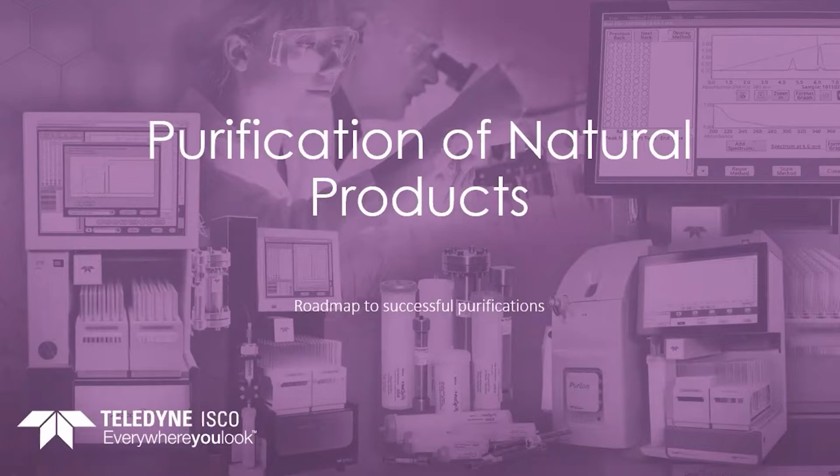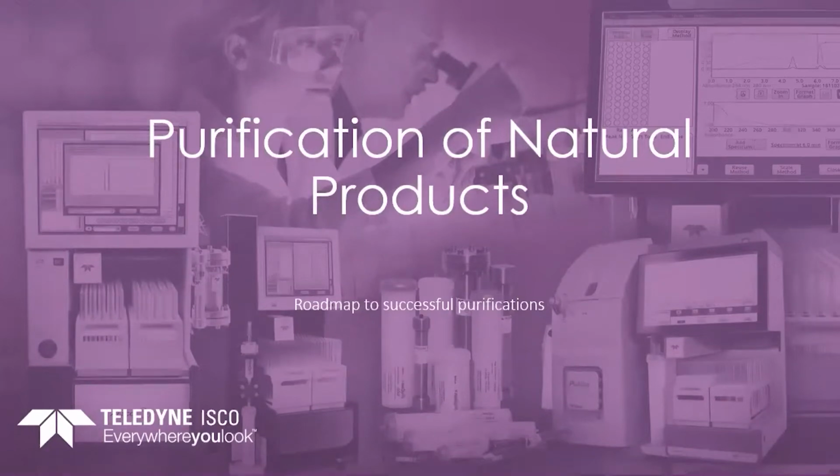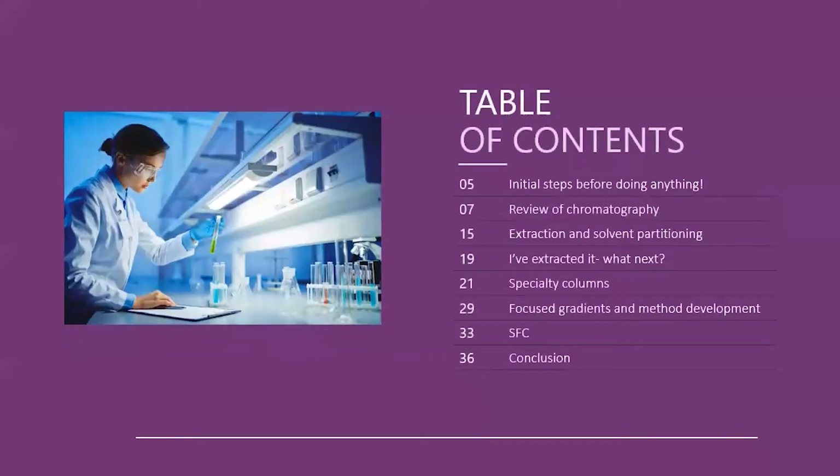Today, we will discuss natural products purification. We will discuss the first steps one should take before doing anything. We will do a quick review of chromatography, which will lead into an overview of solvent partitioning. What happens after you extract your compound? We will discuss specialty columns, focus gradients and method development, and how supercritical fluid purification of natural products can help you purify compounds quickly.